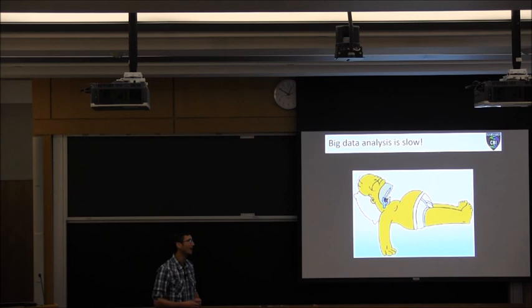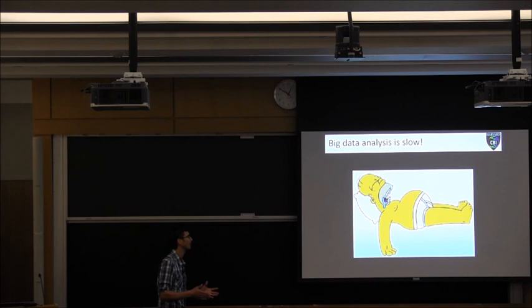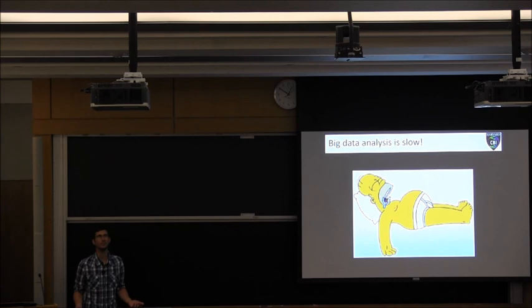The only way to get around this is to just try and pull out some representative small areas of your data, work on that first, get something that's working well there, and then apply that to the big data set. But it definitely can be key. I know that image that I showed you of that Thy1-GFP mouse brain, it took 3 hours to acquire that data. It took me 2 weeks to get that movie afterwards. So it's definitely not a super, super fast process. Okay.